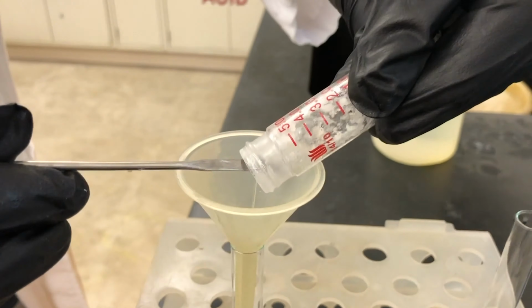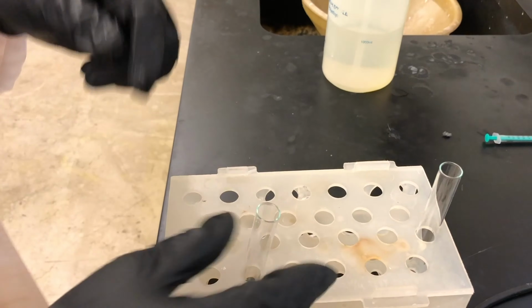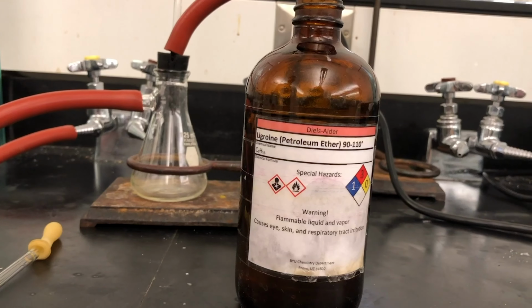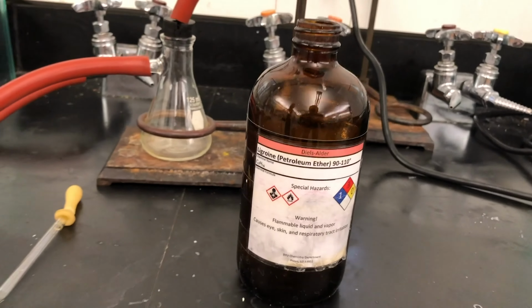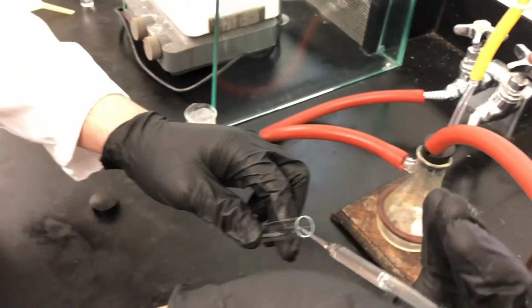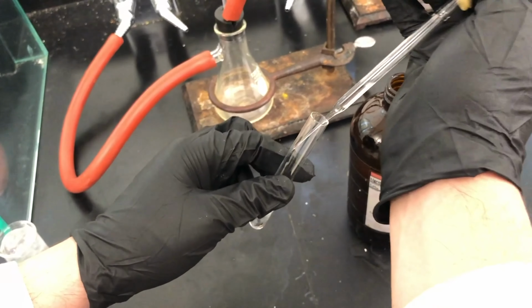So we've just obtained our crude product by evaporating the methylene chloride. Now we're placing it in a small test tube. Now let's talk about the solvent. We're going to be using ligroin or petroleum ether to recrystallize the alcohol. This is a useful solvent for alcohol because it is insoluble at low temperatures but soluble at high temperatures. With a Pasteur pipette, we can start adding some into a separate test tube and then heat it up using boiling hot water.